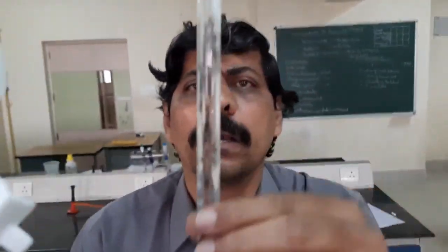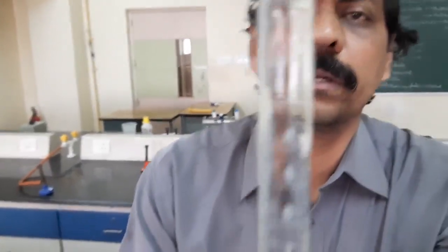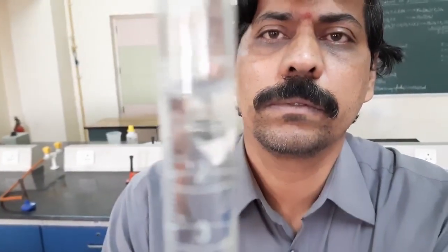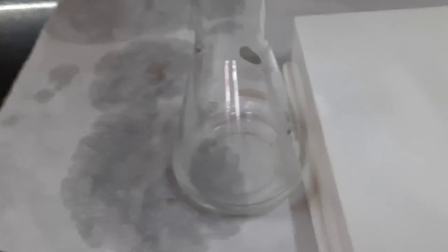And then check the burette reading. The burette reading reads 0.4. Replace the burette into the burette stand and go for concordant readings.